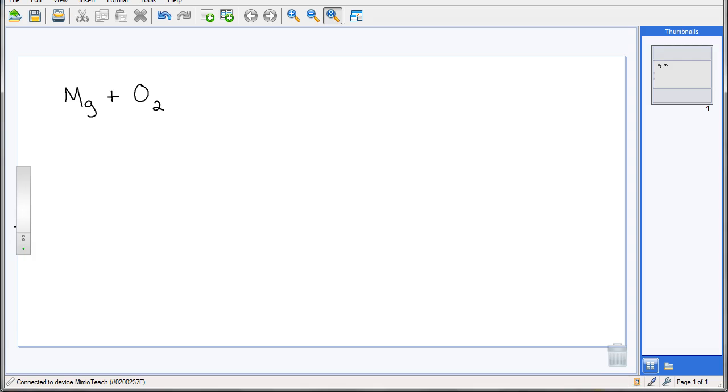I didn't tell you these things in here, but this is sort of the process of trying to figure out what is going on in your chemical reaction. We know the reactants that are going in there. We knew for sure that there was magnesium, and then logic, prior information tells us that you need oxygen as well. So knowing that this is a synthesis reaction, then we know that we're going to have a single product. So that means that magnesium and oxygen are going to have to be combined together.